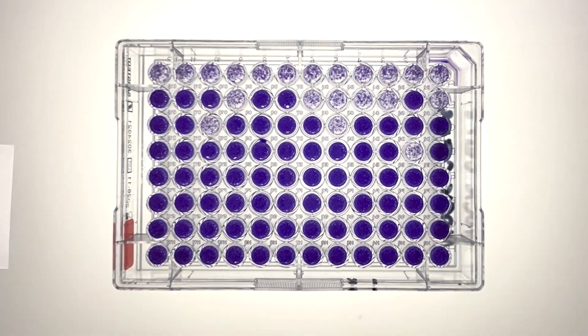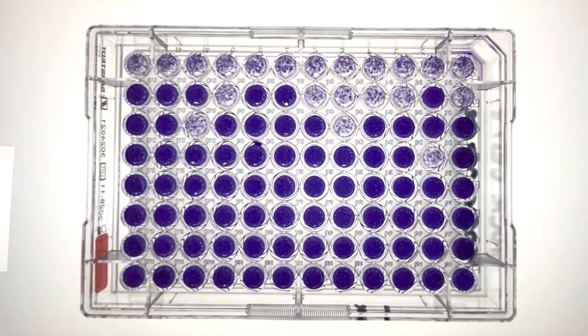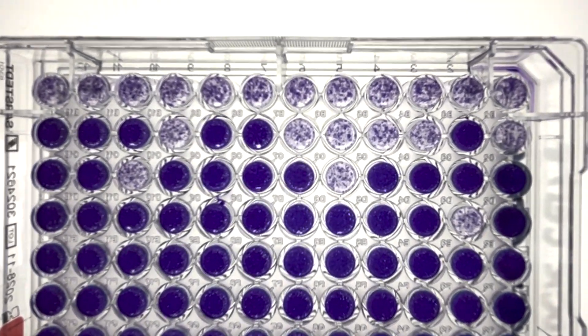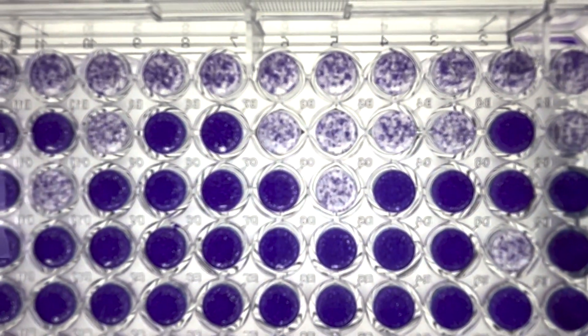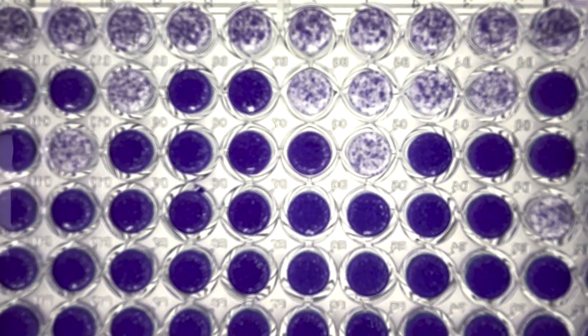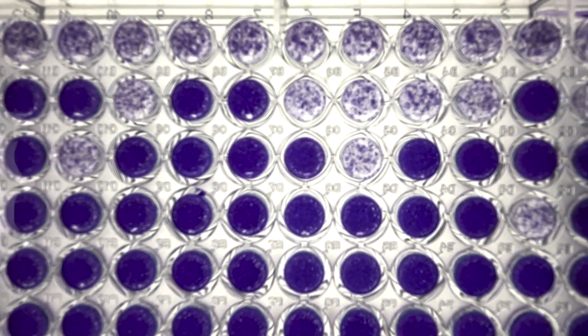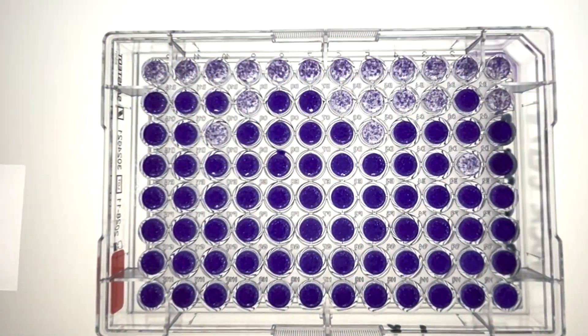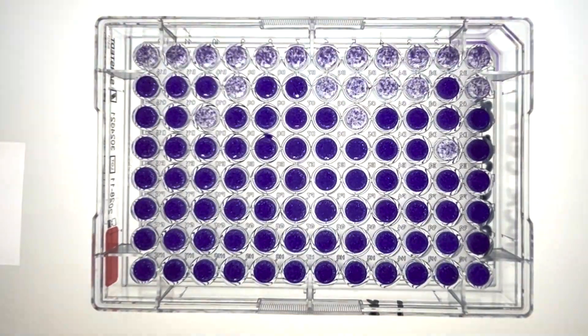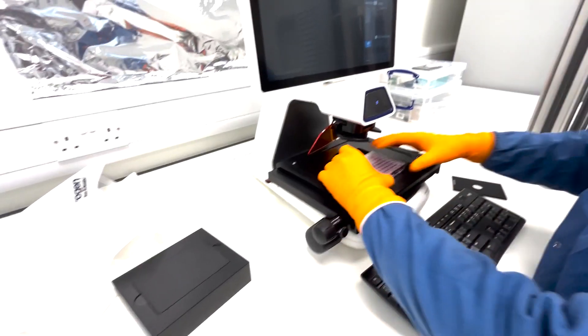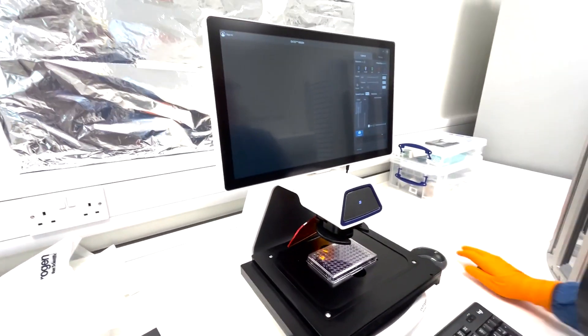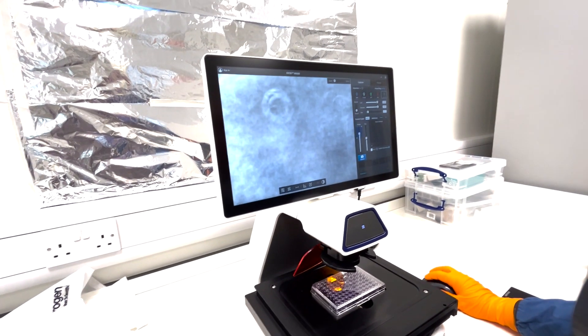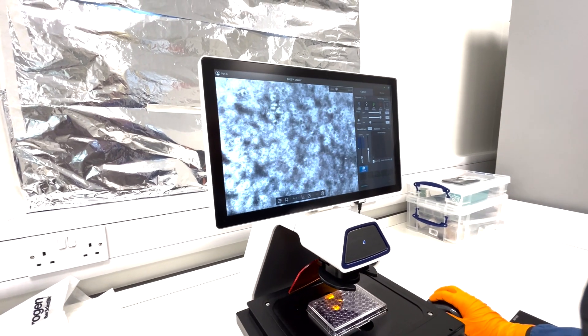The next step in our process is to meticulously score the wells. We're looking for signs of infection, which are typically indicated by the absence of cells or disrupted patches in the monolayer. This is where the crystal violet staining becomes invaluable. It helps us clearly identify which wells have been compromised by the virus. If any results are unclear or require further examination, we take a closer look under the microscope to ensure accuracy in our observations.